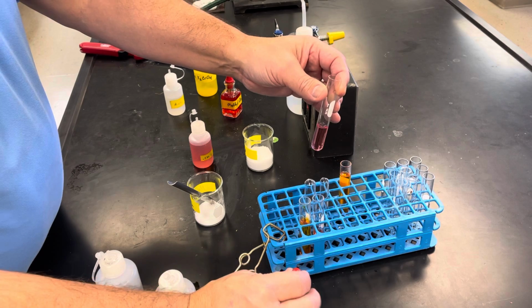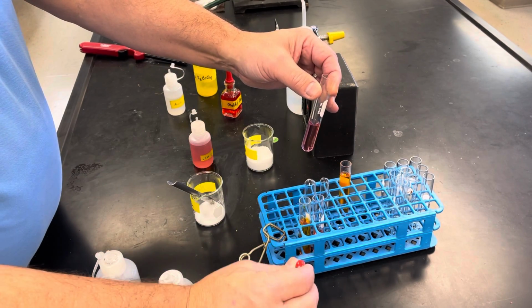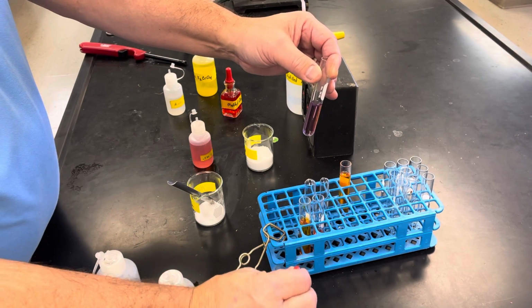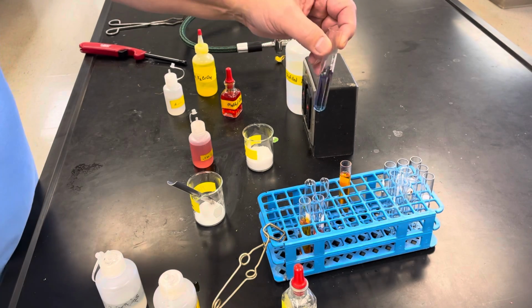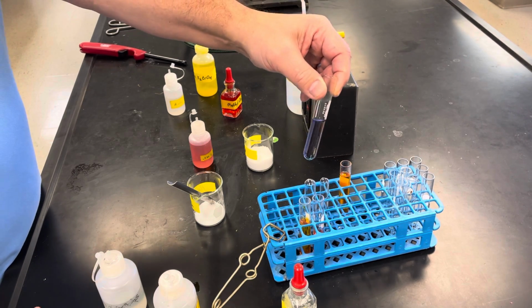But I don't know if you can kind of see the color change taking place. Okay, ooh, I just caught a whiff of the HCl. Ooh, look at that, now it's kind of a purpley color. A little bit more. Now it turned into that blue. So I've shifted it completely to the right.